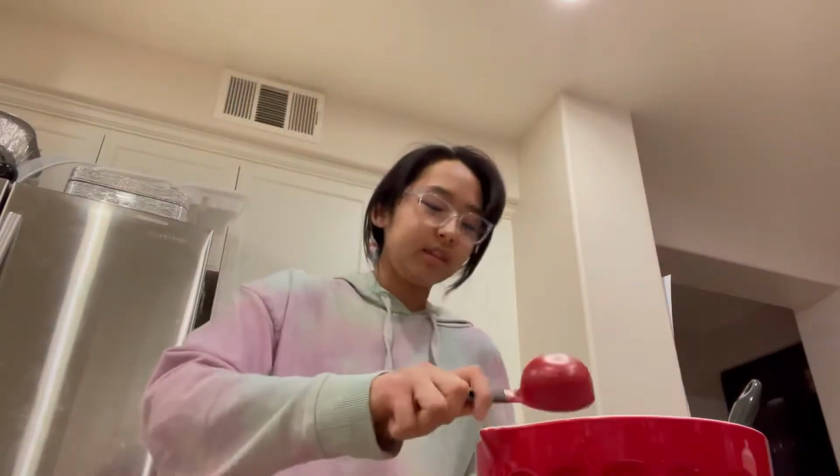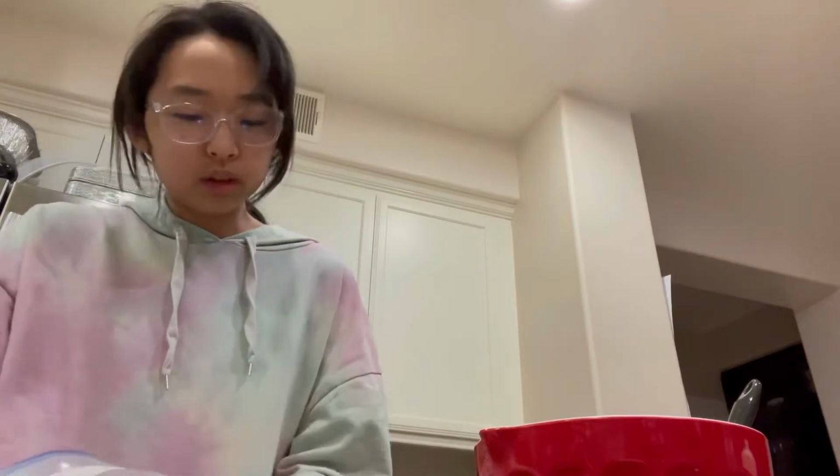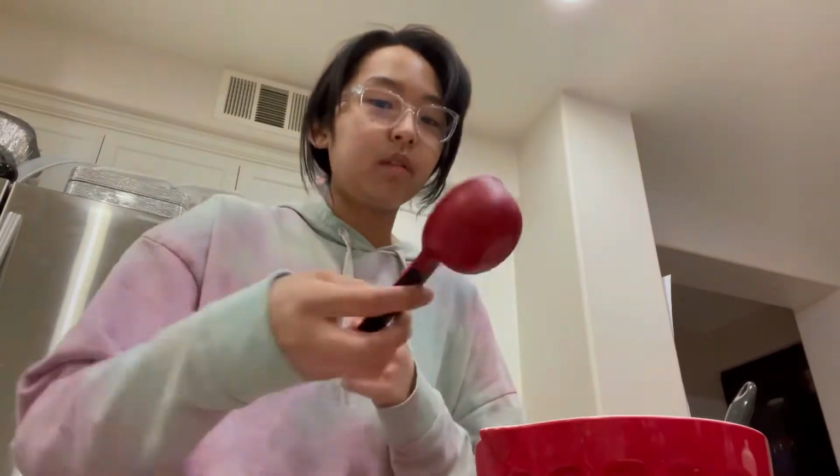Also, you can think of it as before you start the reaction, all of the reactants are separate. But as you're doing the reaction, they all combine together. And then, as you progress, the reaction finishes, and all of the reactants will have combined. So I will be back to show what it looks like when it's done.